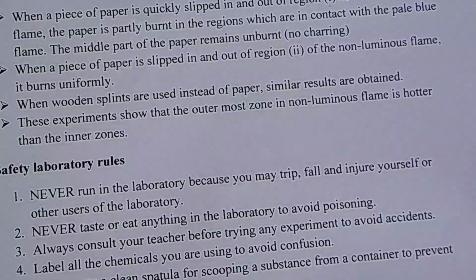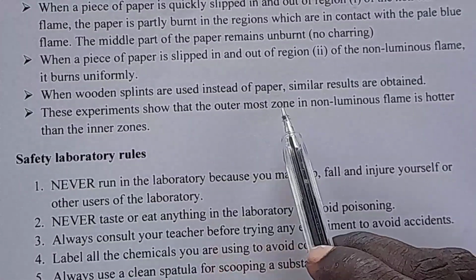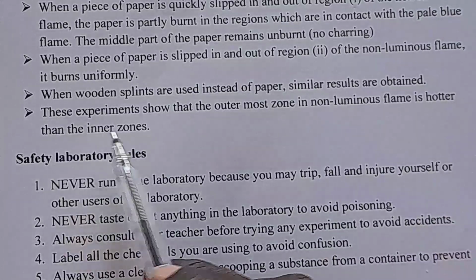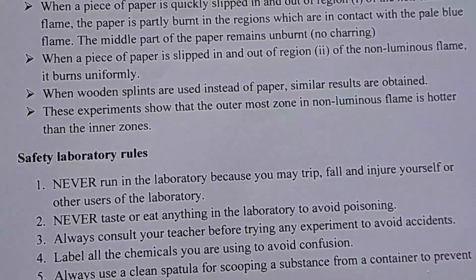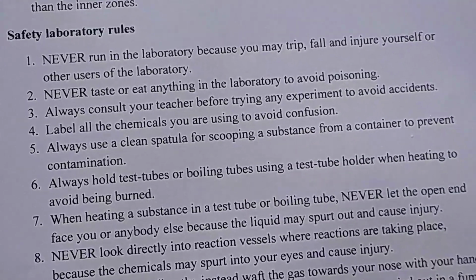Okay. So we are told this experiment shows that the outermost zone, that's the pale blue flame in the non-luminous flame, is hotter than the inner zones. Okay. Then lastly, we are going to go to safety laboratory rules.